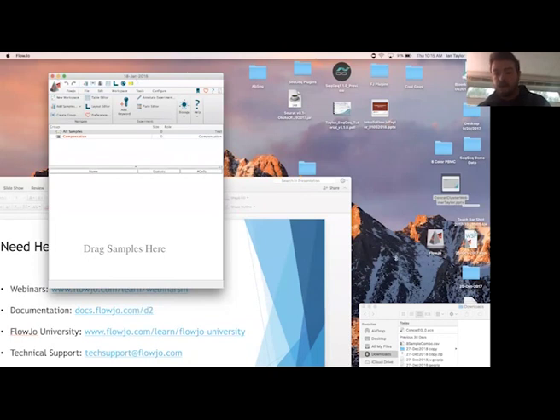I'm getting another question. If you have many samples, 50 or so, would you recommend taking fewer events per sample and including a higher number of samples, or the opposite, taking more events from fewer samples? Yeah, if you have 50 samples that you want to compare in the same t-SNE space, you are absolutely going to need to use all 50 samples.